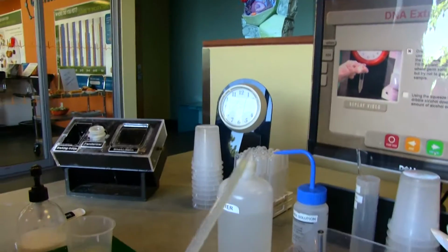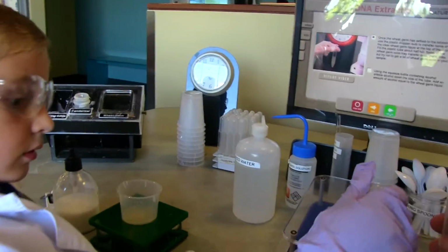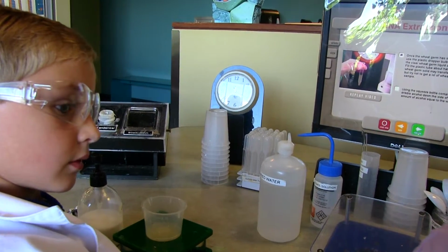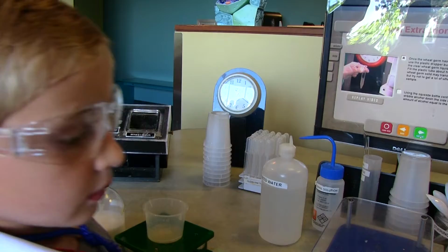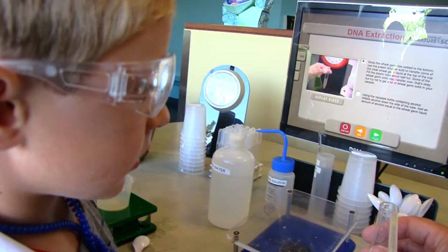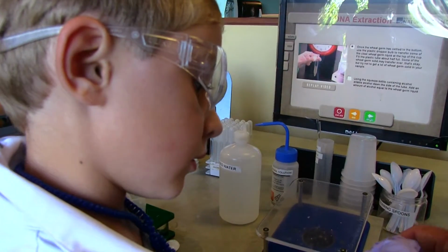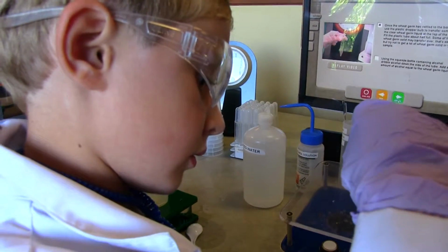Do I put it in there? Okay. Now do I put it in there? Yeah, I think now you put it in here. Yep, squirt it right in.